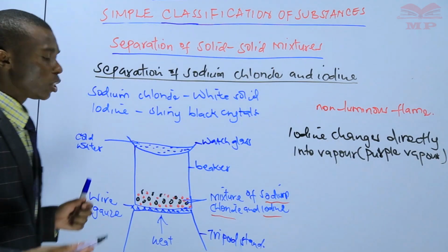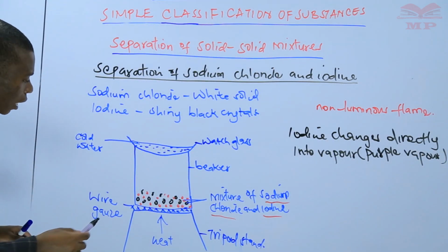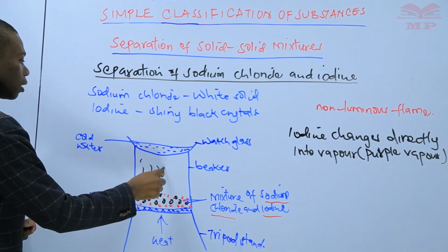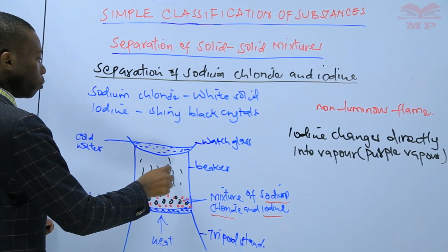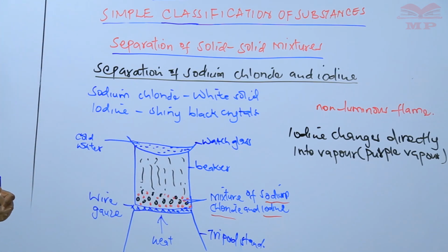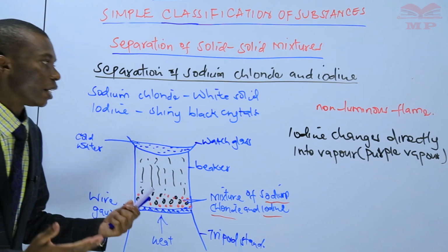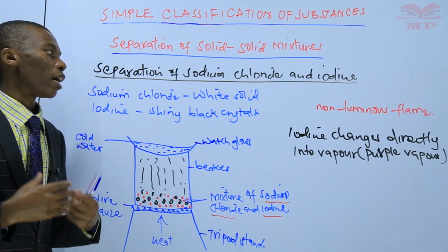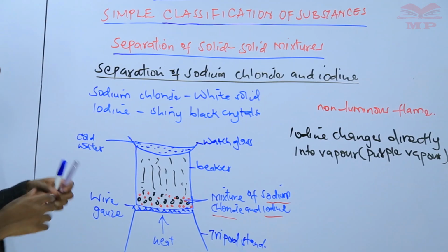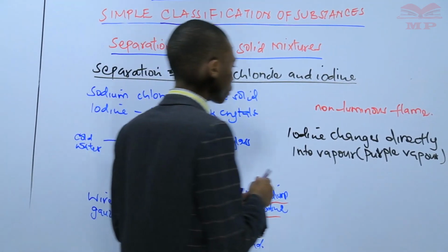After some time of heating, you are going to see the purple vapor moving up from this solid, because iodine changes directly from solid into vapor.